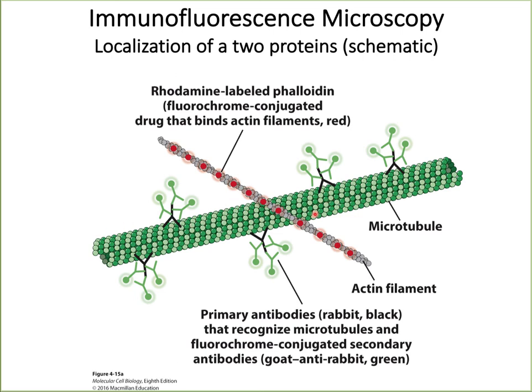So the primary antibody is rabbit. And the secondary antibody is goat, which means it was raised in goat, anti-rabbit. Just make sure that you clearly get this concept. So how is this secondary antibody raised? Any general antibody, which is an immunoglobulin from the rabbit, if it is injected in a goat, will actually develop antibodies inside the goat against this rabbit antibody. So that is called the goat anti-rabbit antibody, which will bind to the Fc portion of the rabbit antibody.